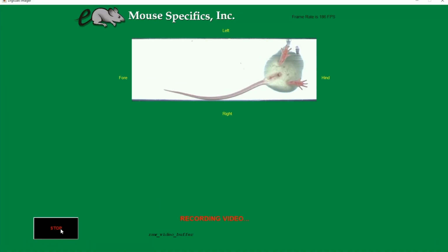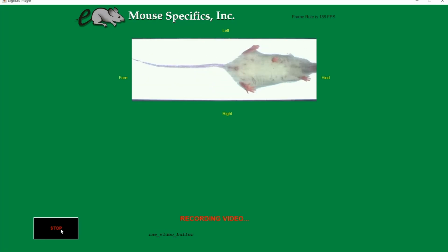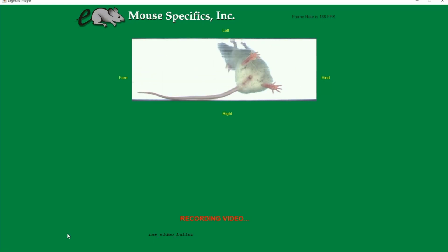on. Watch as the animal runs on the treadmill and look for some segments of walking that you want to save and analyze. When looking for data, we are hoping to capture about 3 to 6 seconds of good quality walking from your animal. Once you've captured enough data, you can turn the treadmill off and click Stop.